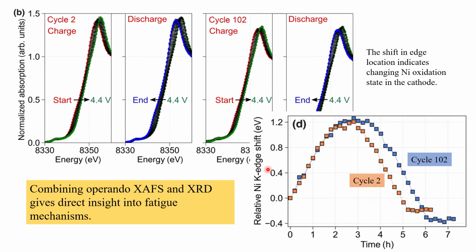So purely analytical, and they could do it every day as they changed the battery chemistry. And so you look at this and start asking, could XAFS be part of quality control in battery manufacture?